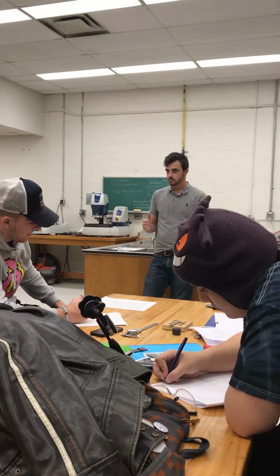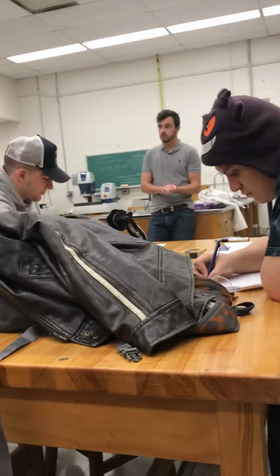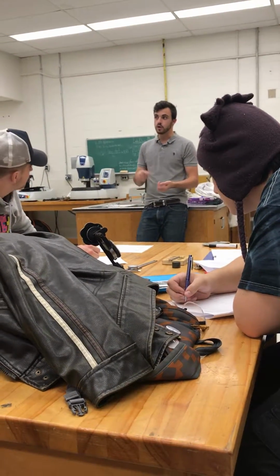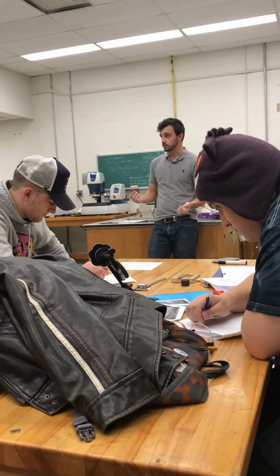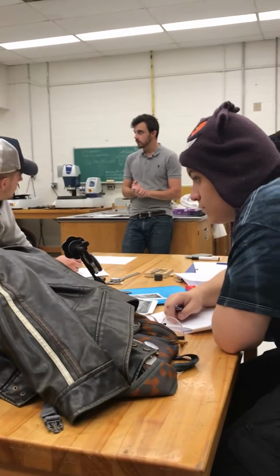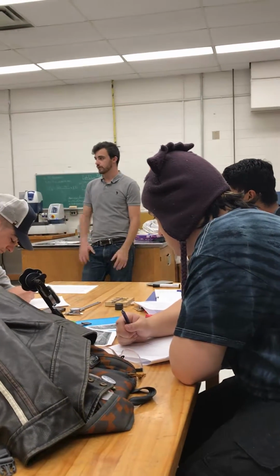Is that for both, or only the one that was not annealed? Only one of them is going to actually look squished, so only the one that was squished. Both of these samples have been 70% cold worked, and then one was annealed. So you're only going to be able to see the compression on the non-annealed sample, because when you anneal a sample, you have recrystallization and regrowth of your grain structure, which makes them look like equiaxed grains again. Is that clear? So we draw the arrows of compression, the direction of load applied, so that I can see what direction you figured it would be compressed.